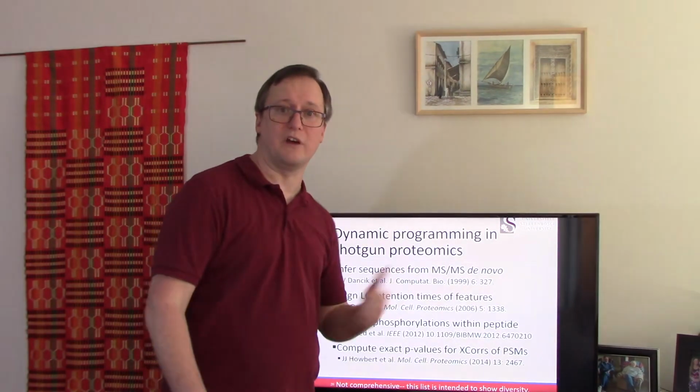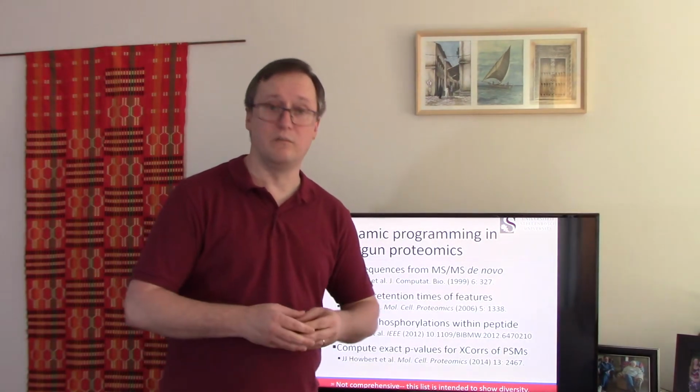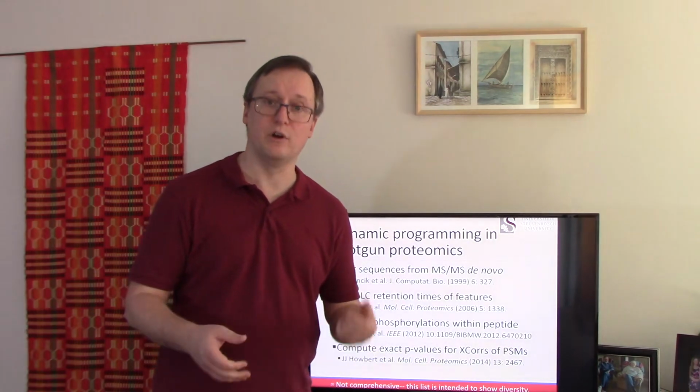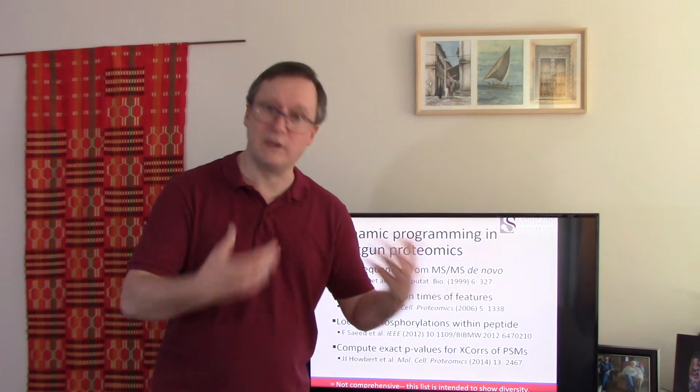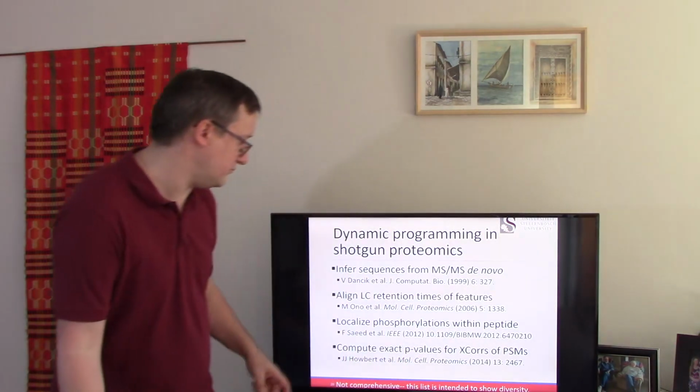And it doesn't have to be software from these guys to do that. Most of the de novo tools out there will use dynamic programming as a way to pull the optimal path out of the relationships found between peaks.